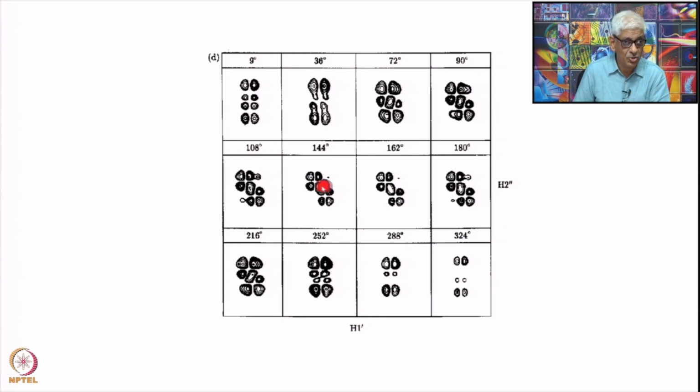But most importantly you can see the way these peaks which were earlier present in this area have been reduced to 0 intensity. Therefore you do not see these peaks there, and you will see better resolution within the fine structure. You will see 8 components here, instead of the 16 components, and that is very clear. Once you have these 8 components, you can measure these individual coupling constants very clearly in this area. All this corresponds to the C2' endo geometry area. This is the C3' endo geometry area.